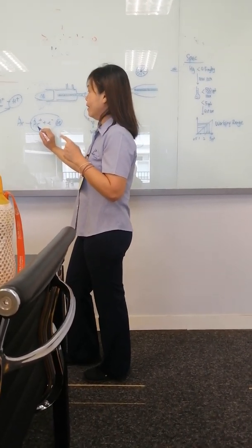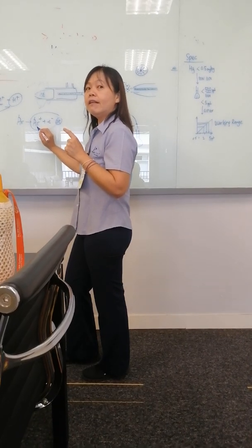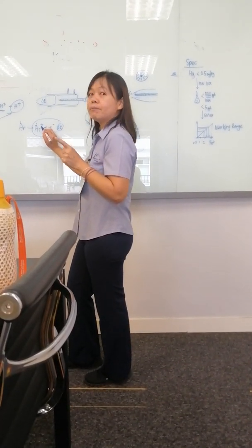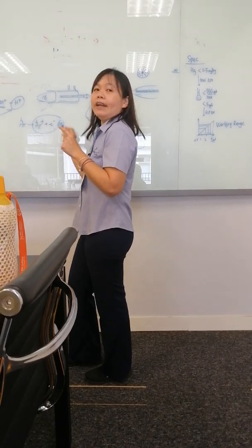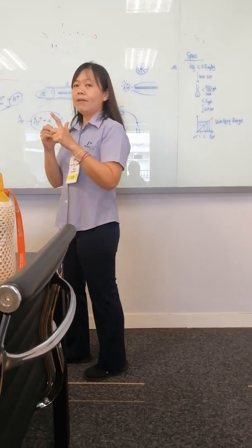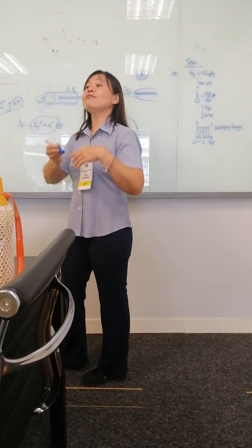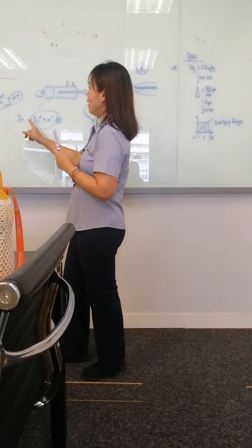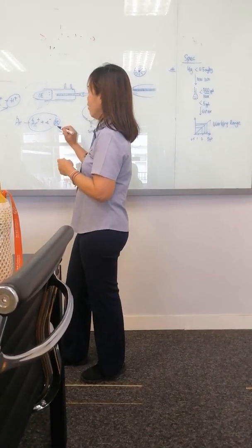Ion, and then it's ionized. It contains the same amount of ion and the same amount of positive and negative charge in the aliran here. So meaning to say, aliran means it never stops. Aliran sungai itu tak pernah berhenti. So the moment you turn on the plasma, plasma is like that. Okay. And then they have a lot of energy.